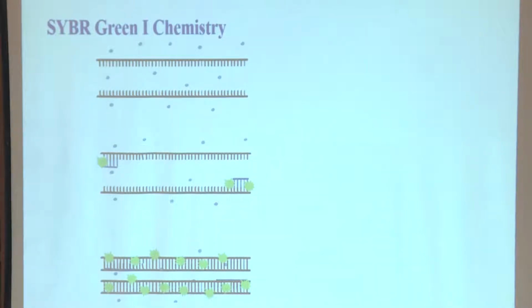Now, you put the template. How much template do you put? We already discussed. In some applications we put 50 nanograms, 100 nanograms. I suggested 200 nanograms. Along with that, you have dyes also. So, what is happening is when you set up PCR, the repeated cycling adds up further double stranded DNA from the template. So, there is a progressive increase of double stranded DNA. During that step, what happens?